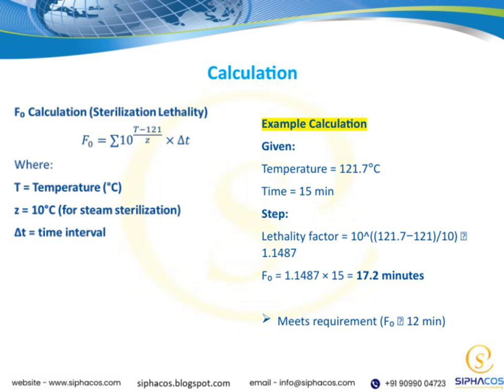And here's the important part. Since our F0 value is 17.2 minutes, it clearly exceeds the required minimum of 12 minutes. This means our process meets the necessary sterilization standards. This example highlights how we can quantify and verify the effectiveness of our thermal process, ensuring safety and compliance.